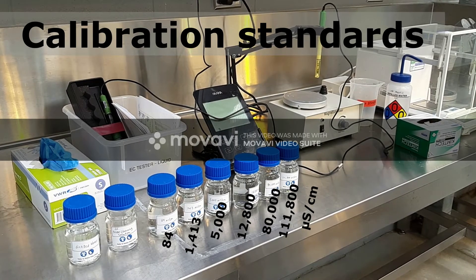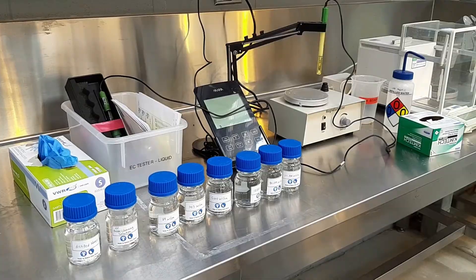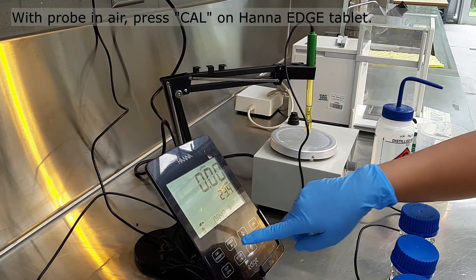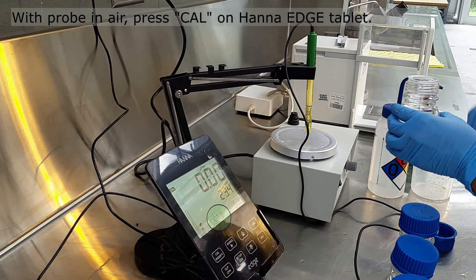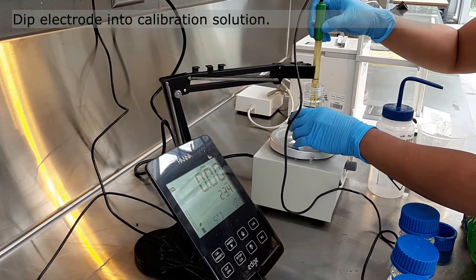Choose a calibration standard with a concentration higher than your test solution. With the electrode in air, press CAL on the tablet. Wait until the display shows STD.